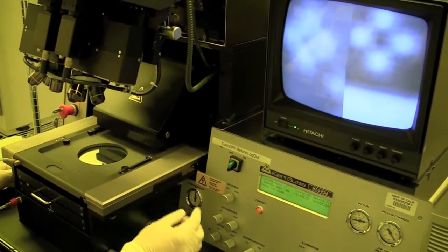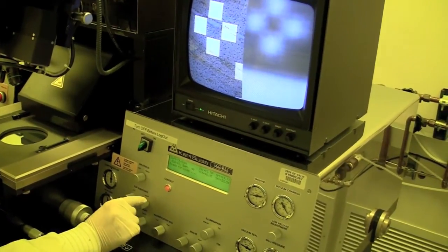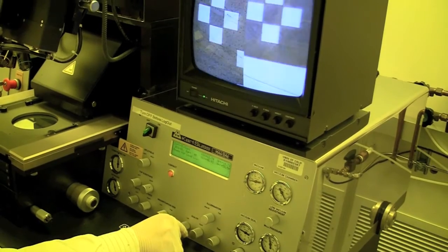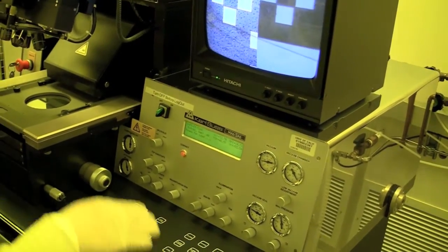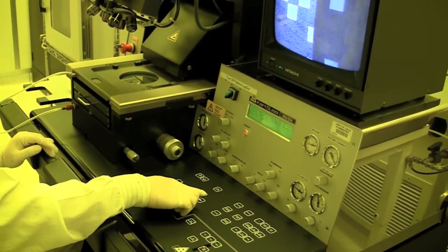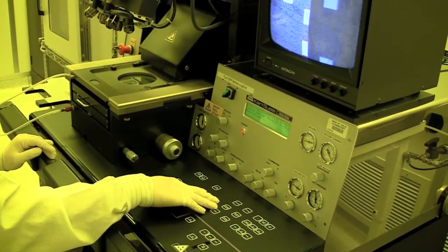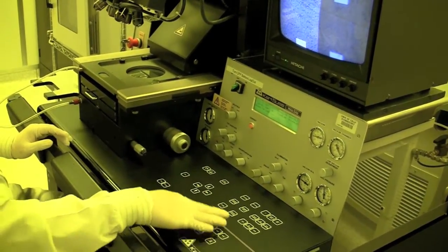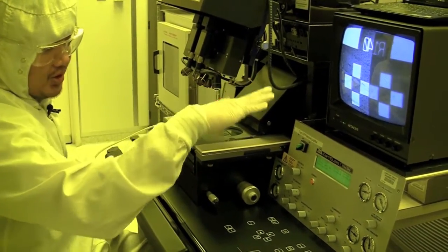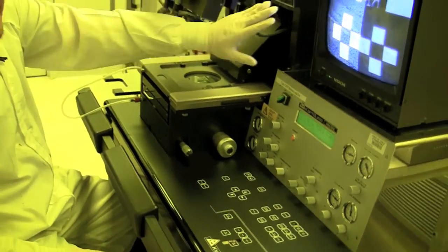We need to adjust the focus using top, straight, left, and right — the left will adjust the left, and the right one will adjust the right focus. You can also adjust the intensity and the position. If I want to move one up and down, I'll hit right and then move it up and down. When you find your mask and you think you're ready to do the exposure and align it, you grab this image by pressing the 'grab image' button. When you press that, it takes a picture of the mask.